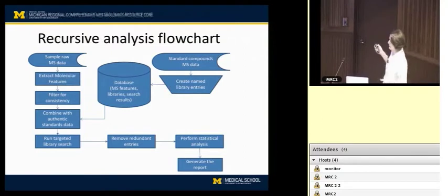and then there are some things that are unique. For example, when you're looking at standards, you might want to note that the primary ion, the molecular ion, is maybe not necessarily the most intense ion, because some compounds really like to pick up a sodium adduct, and I'll talk about what adducts are a little more later, but that is something you want to capture in your library.